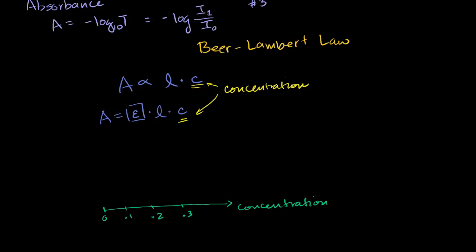And over here, you are measuring absorbance. In the vertical axis, you measure absorbance. Just like that. Now, let's say you have some solution and you know the concentration. You know it is a 0.1 molar concentration. So let me write down M for molar. And you measure its absorbance, and you just get some number here. So this is a low concentration, didn't absorb that much. You get it at, I don't know, some number here. So let's say it's 0.25.